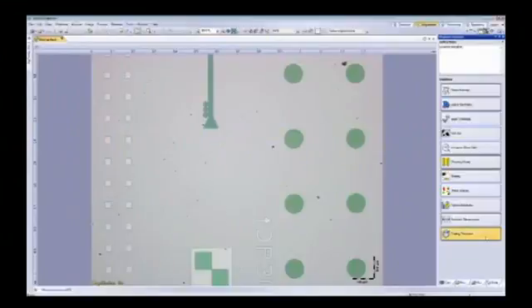Can you show us a couple of those? Yeah, two of the new ones that we added to Stream 1.9 are automatic measurement and coating thickness. So automatic measurement is just that. The software can actually take a motorized stage and drive around and take automatic measurements of patterns. These patterns can be repeatable in different areas. There might be something where the customer is looking at a pattern and they want to take it off, process, like polish or do something else to the sample, put it back on and move right back to that.